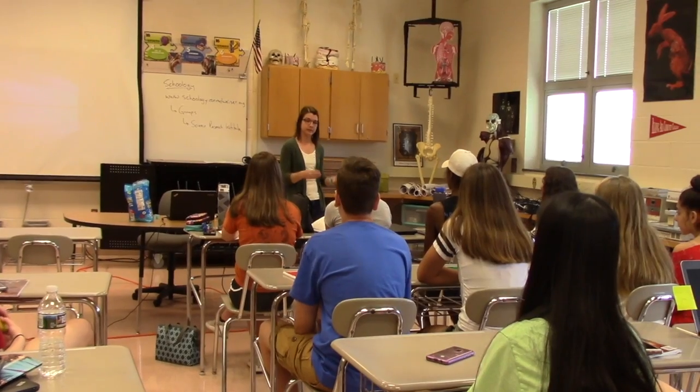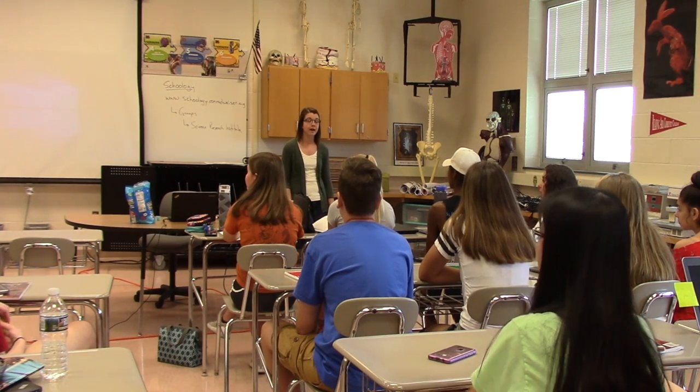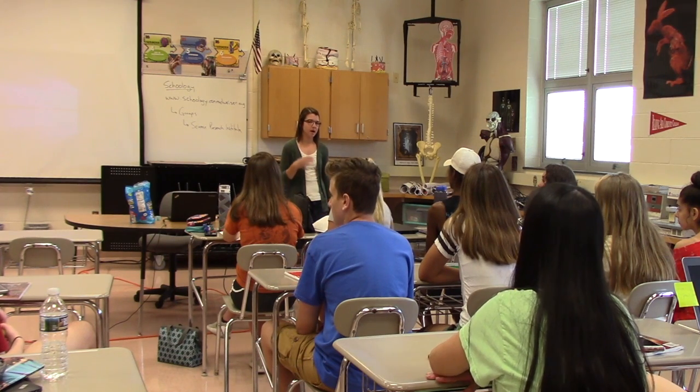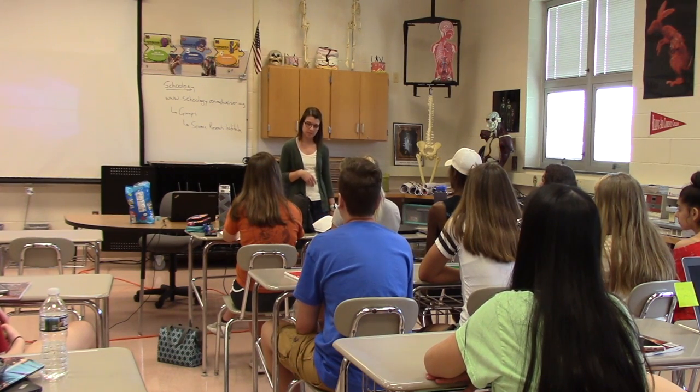So as I complete the step, I'm also writing it in my notebook. And if we were to have someone from the FDA come in or someone to audit us, and they see that I'm not doing that correctly, we can get in trouble. So it's just a lot more regulated of an environment.